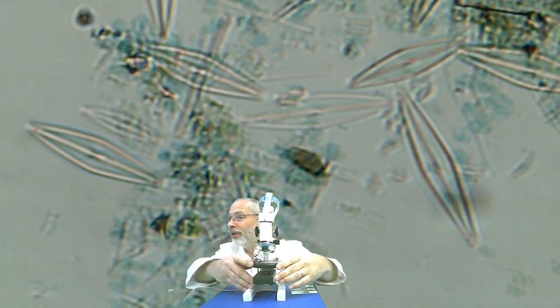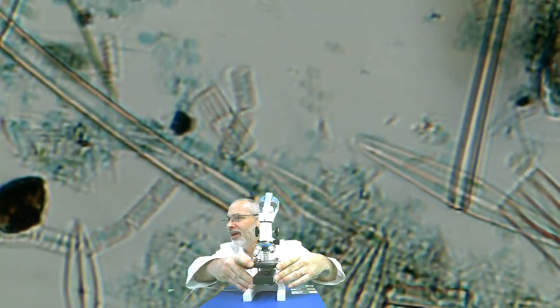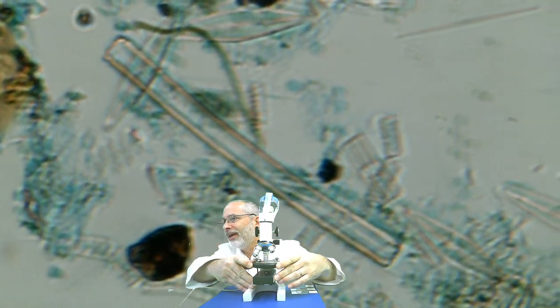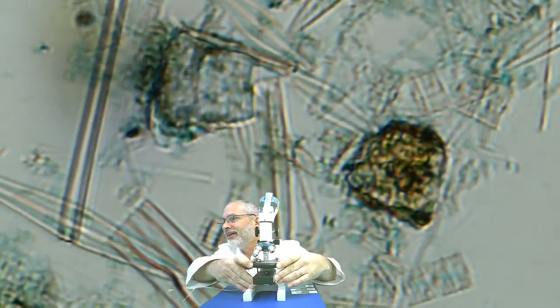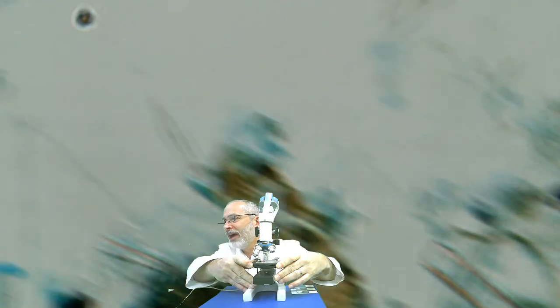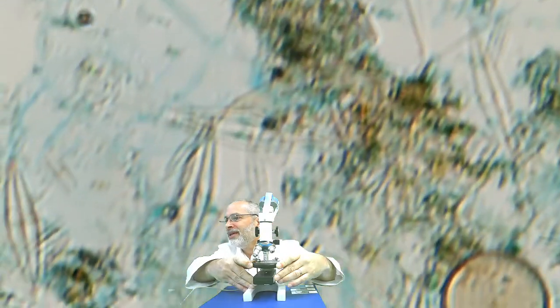I'm just going to move around to see some of the other diatoms because I just think they are so wild here. Let's see here. I know you've already drawn your 100 times magnification. I'm just playing right now, trying to find some cool ones because there's some other ones that, to me, look like combs. Maybe you saw them in the 40 times magnification.